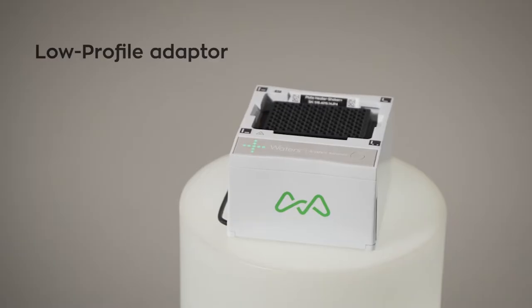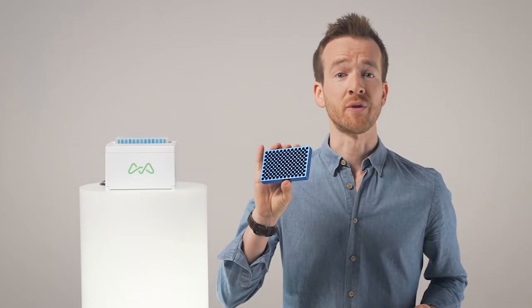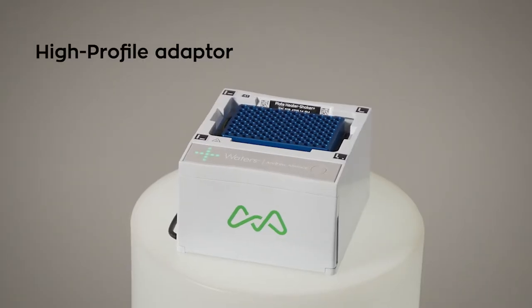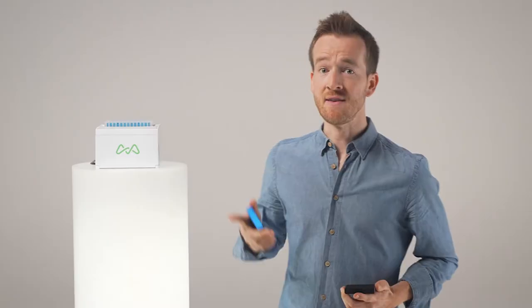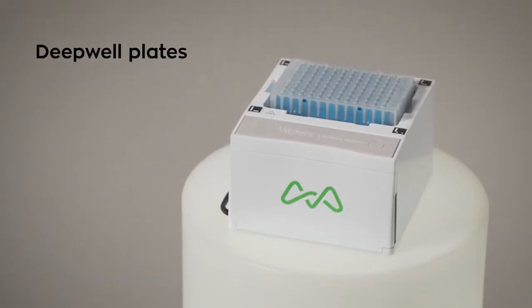There are three adapters to choose from. The low profile adapter for directly holding standard PCR type plates. The high profile adapter for holding higher sitting plates, like those that use interchangeable strips within a frame. And deep well plates, with working volumes going all the way up to 1.3 milliliters.